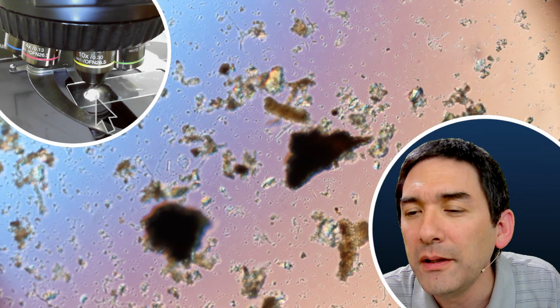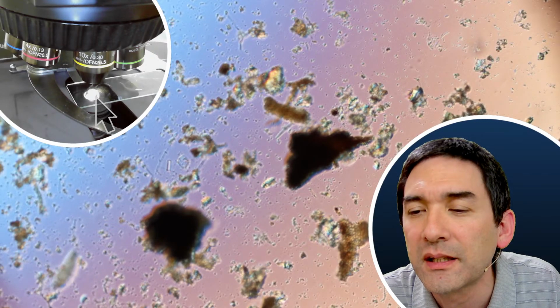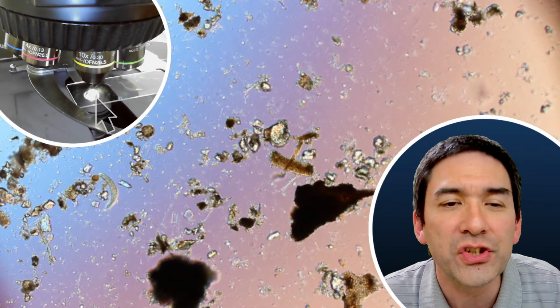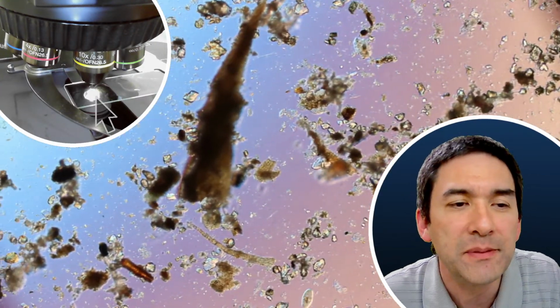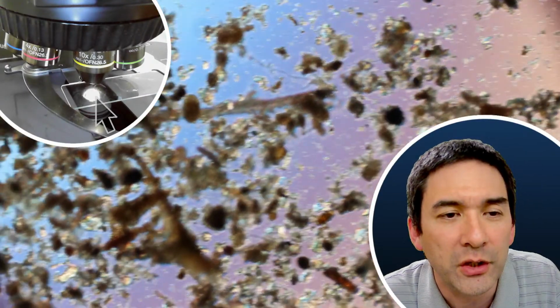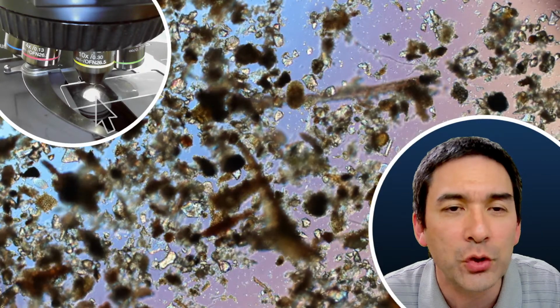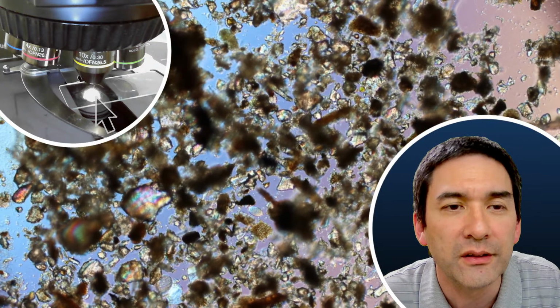Maybe the light microscope looks at it top down. It does not really look 3D, but still sometimes the cover slip actually squashes the sample a bit. That is correct. However, because there is usually some moss or some sediment on the glass slide, this keeps a safe distance. So up to this point, luckily, I could not squash any tardigrades because there was always too much other material on the microscope slide, which prevented the cover glass from crushing it.